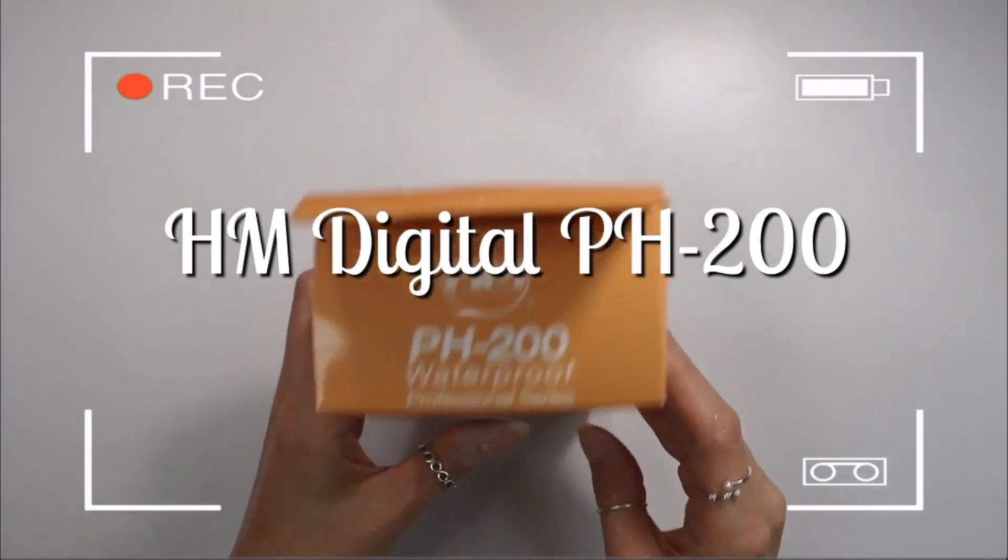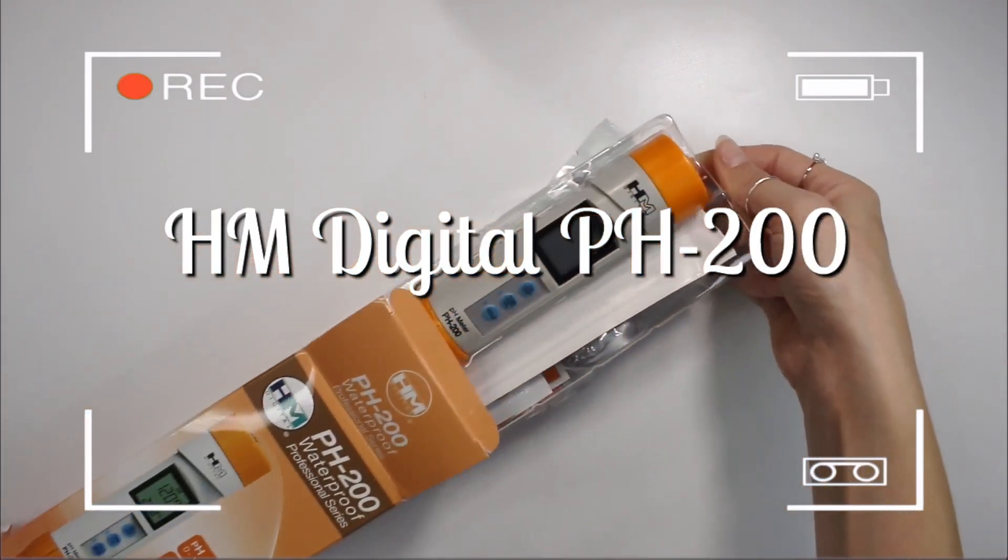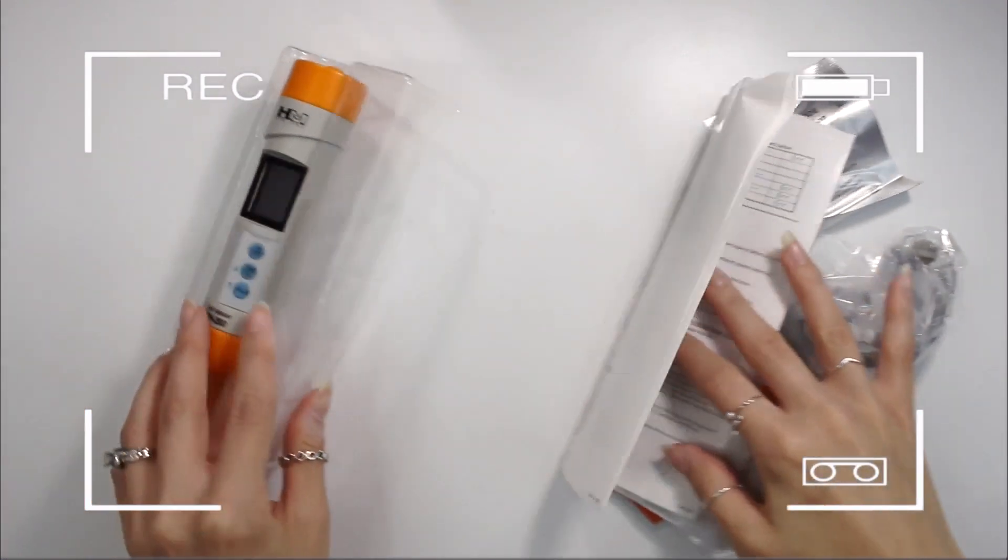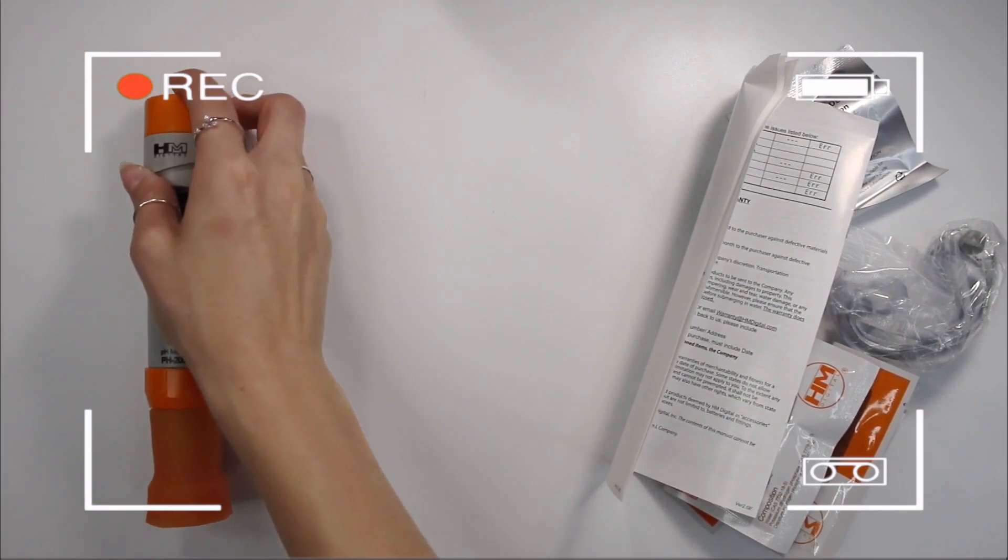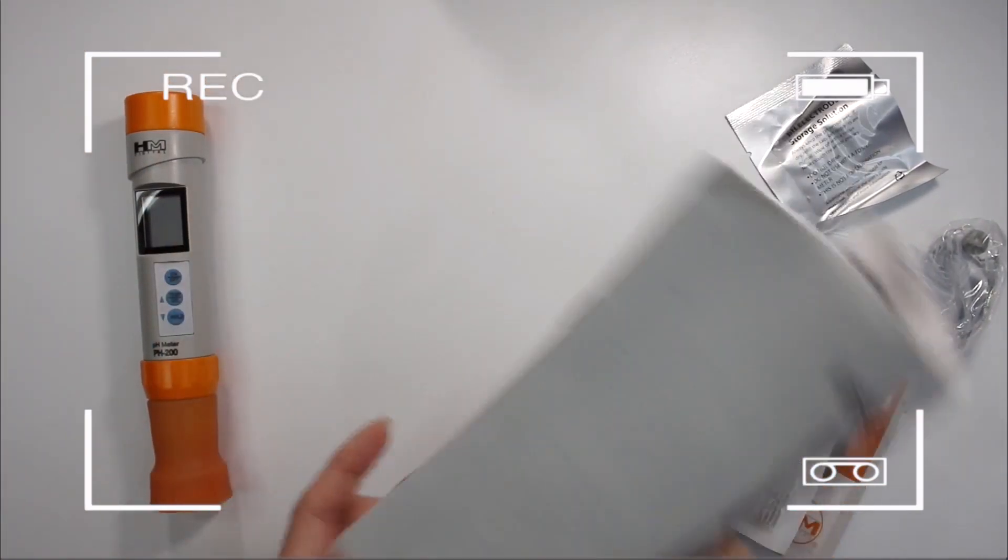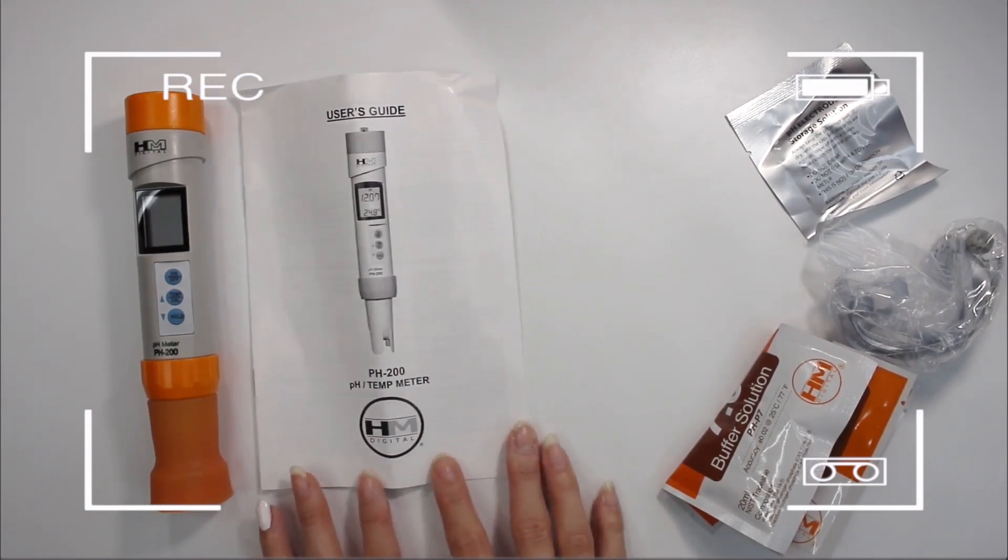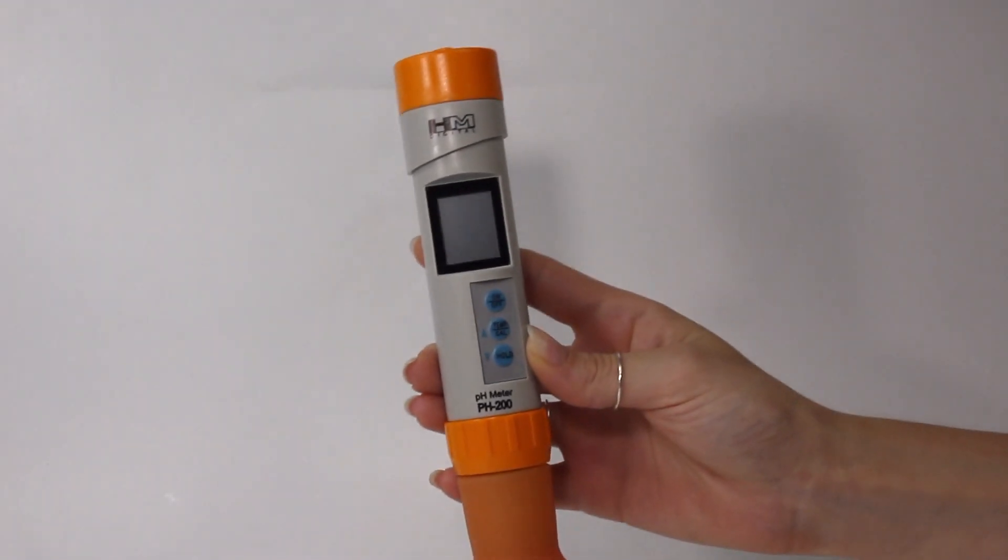It's a video of me unboxing my new HM Digital pH 200 pH meter, and this is a really good high-end pH meter. So if you're serious about making cosmetics and you want to make sure you're getting accurate pH readings of your cosmetics, then I highly recommend this pH meter. And in that video of me unboxing this pH meter, I go into the details on how to calibrate it and how to take care of it.